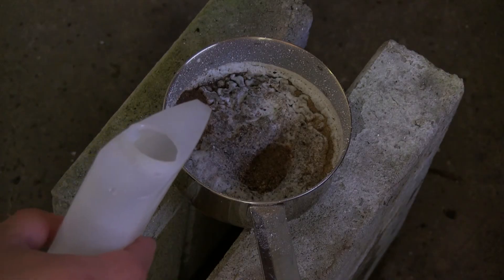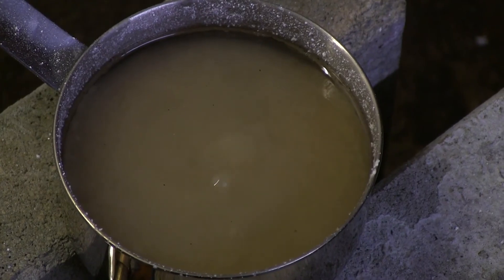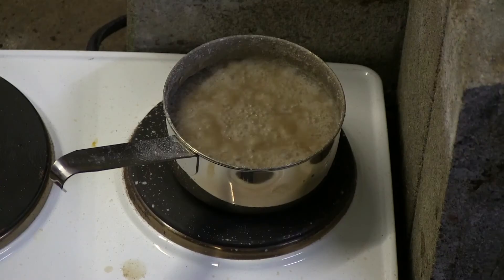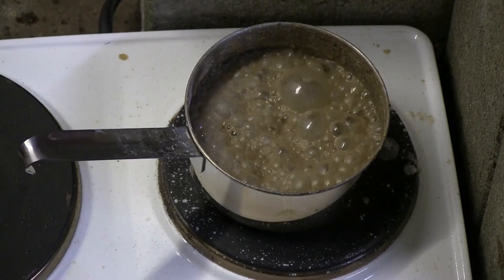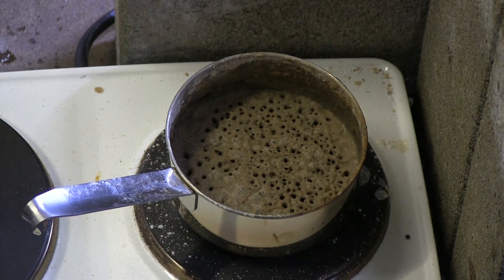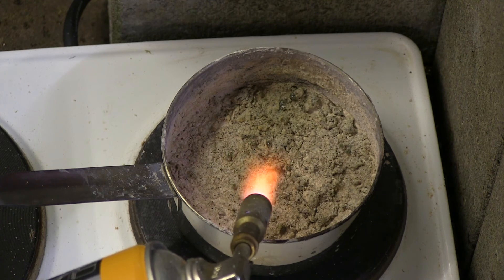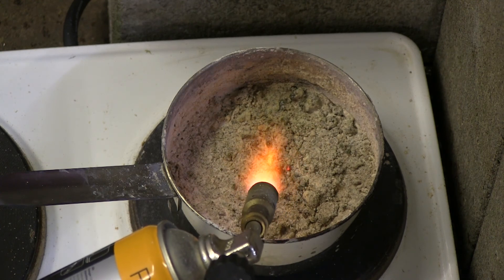After fiddling around a bit, I decided to dissolve everything into water and then evaporate it, so that I could have a fresh start to reheat it again. After getting bored of the blowtorch, I decided to get help from the portable stove, and used that to evaporate the water. After the water had evaporated, I used both the stove and the blowtorch to heat the reaction mixture as high as possible.